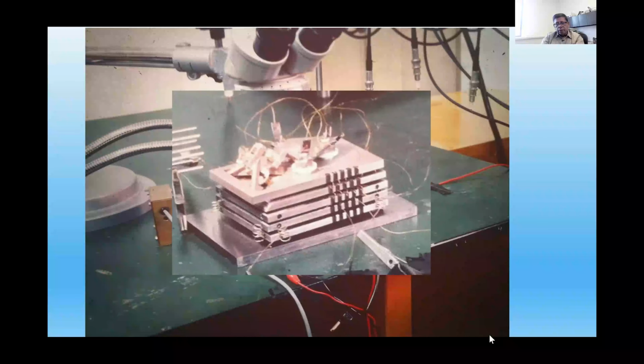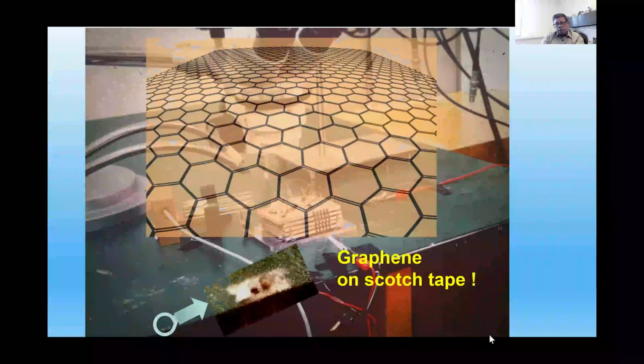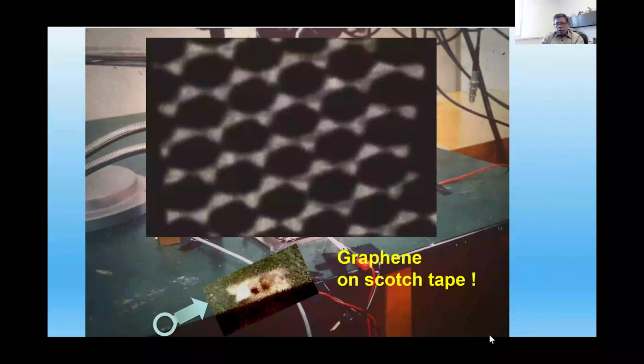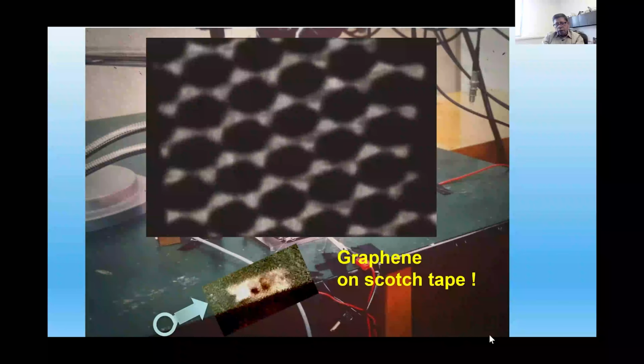It's basically handmade. They took a graphene monolayer out through a scotch tape, and then imaged those hexagonal lattices. That shows the fundamental principle of that technique to resolve things at atomic scale, and that really developed into a very sophisticated AFM-type imaging tool later on.